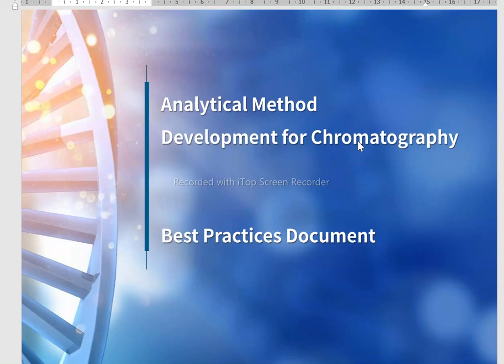Actually, today's topic is the analytical method development for chromatography. In this series of videos, I will tell the best practice procedure and the perspective behind starting analytical method development for liquid chromatography. So what is the perspective behind this? What is the reason, which trend do we have to follow, and what are the standard specifications during analytical method development? We are going to discuss all these things in this series of videos.